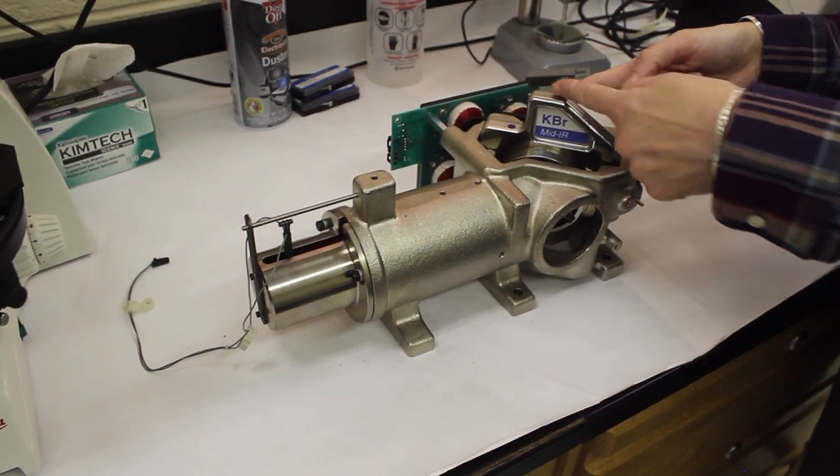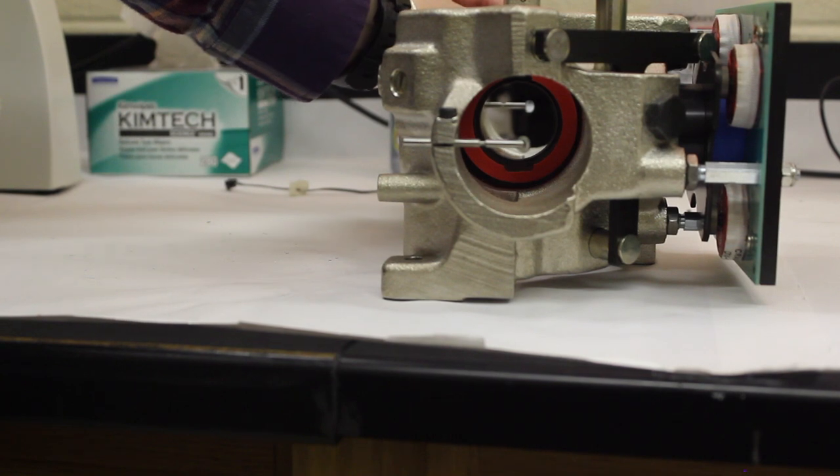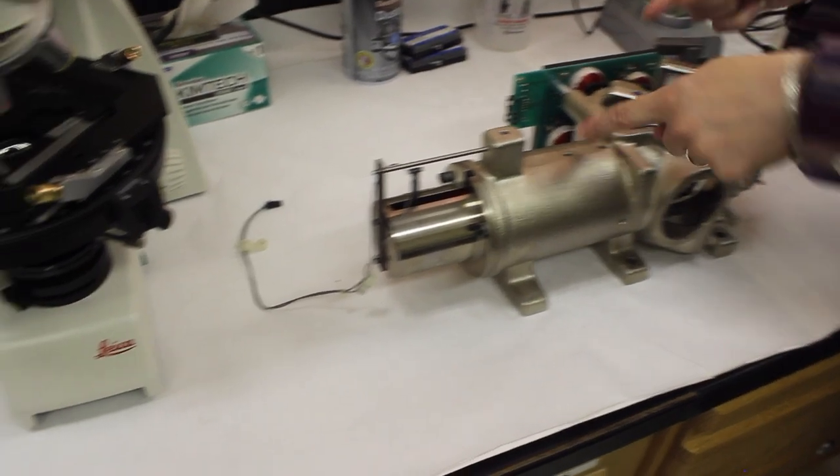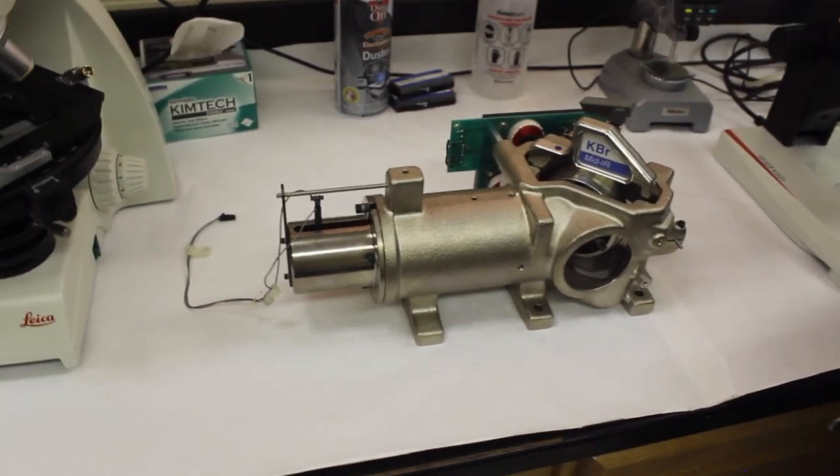Half of it will go through the beam splitter and hit the stationary mirror, and half of it will get reflected and hit the moving mirror. And then those will bounce back and recombine, and we'll use that to make our measurements.